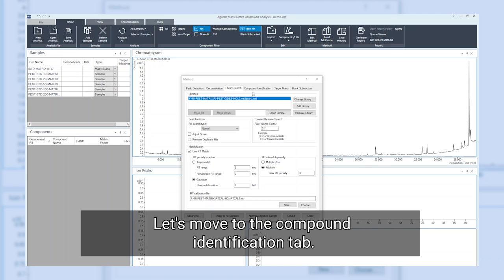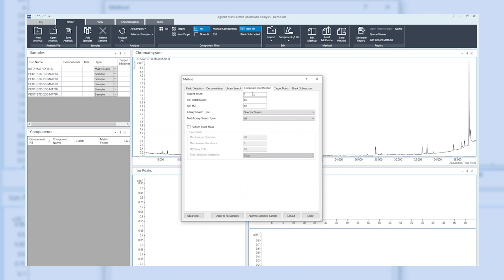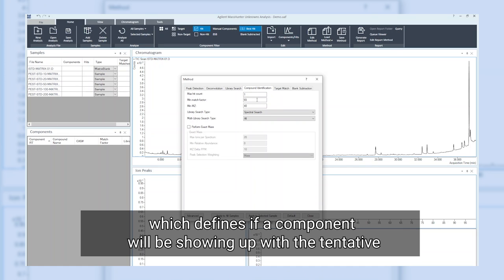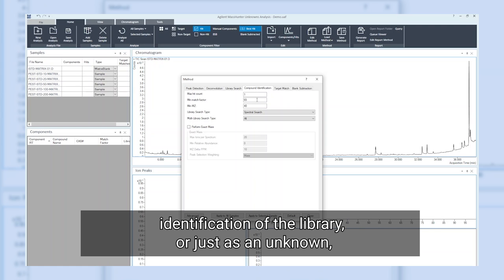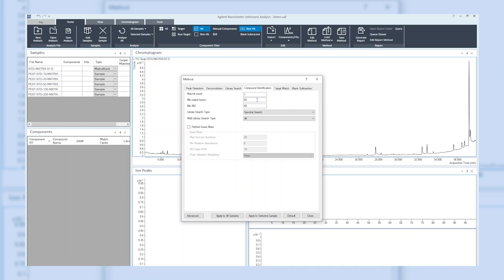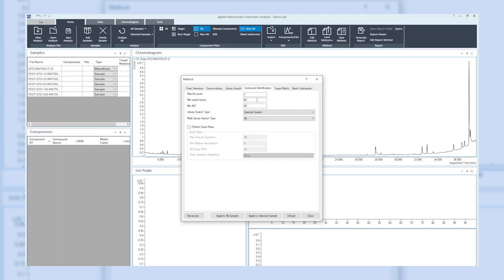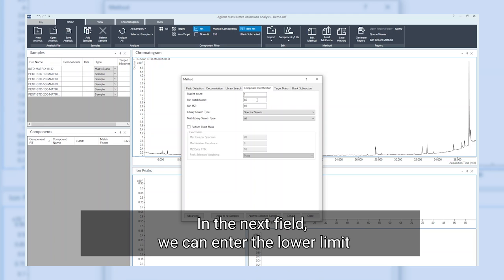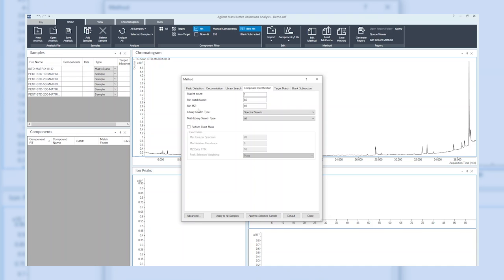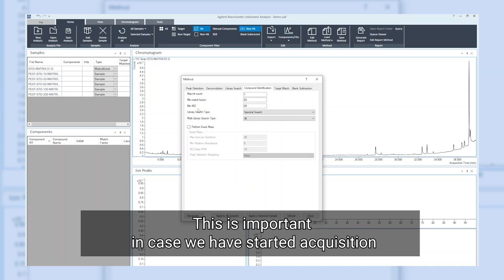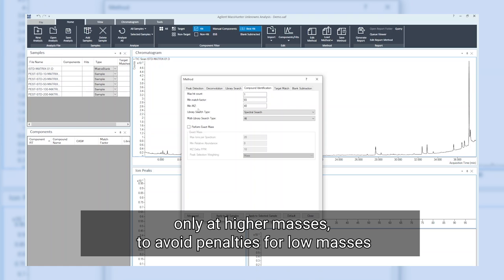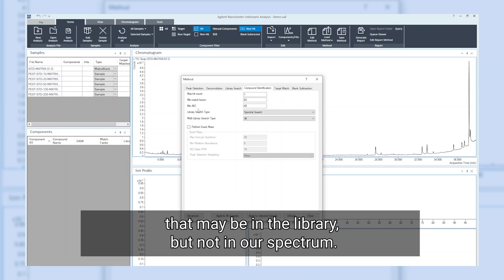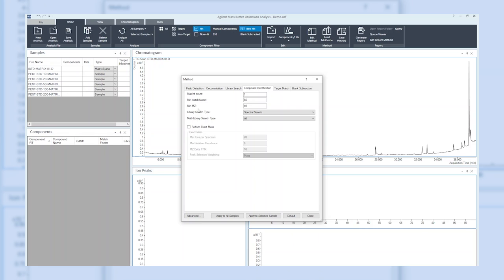Let's move to the compound identification tab. The minimum match factor is a threshold which defines if a component will be showing up with the tentative identification of the library or just as an unknown in case the mass spectral match was below the defined threshold. In the next field, we can enter the lower limit for the m over z values to be considered for a spectral match. This is important in case we have started acquisition only at higher masses to avoid penalties for low masses that may be in the library but not in our spectrum.